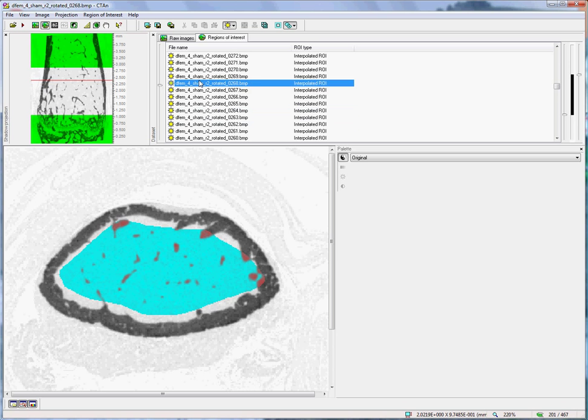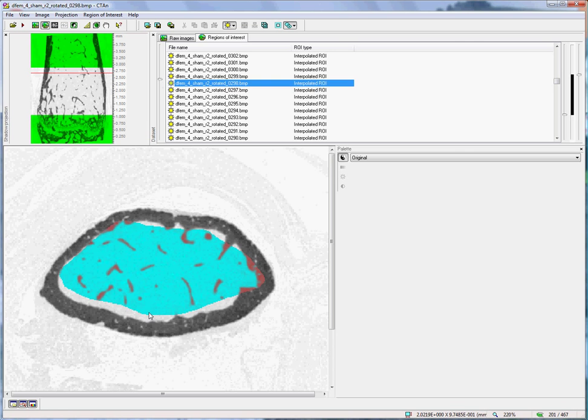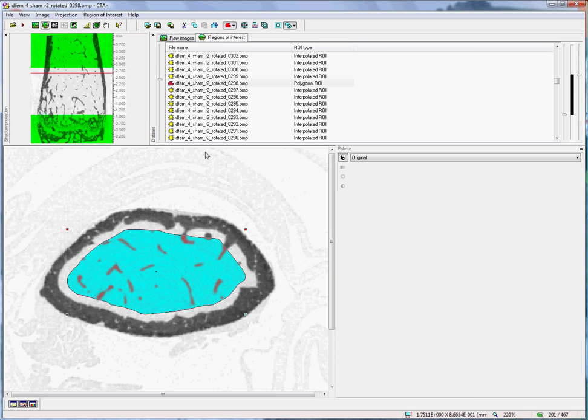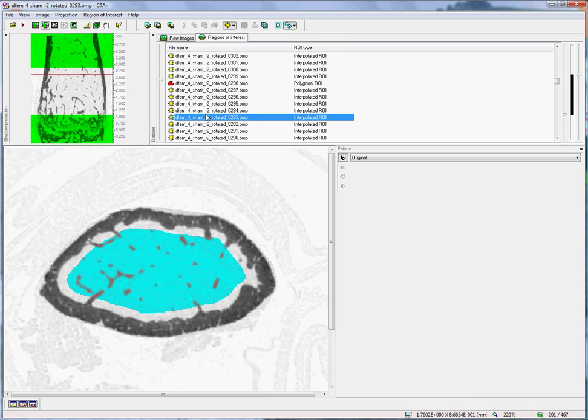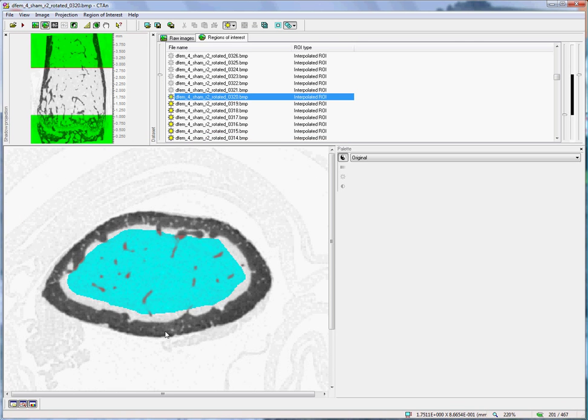A couple more slices should probably do the trick. Of course, this is a somewhat subjective procedure. It has to do with the best one can.